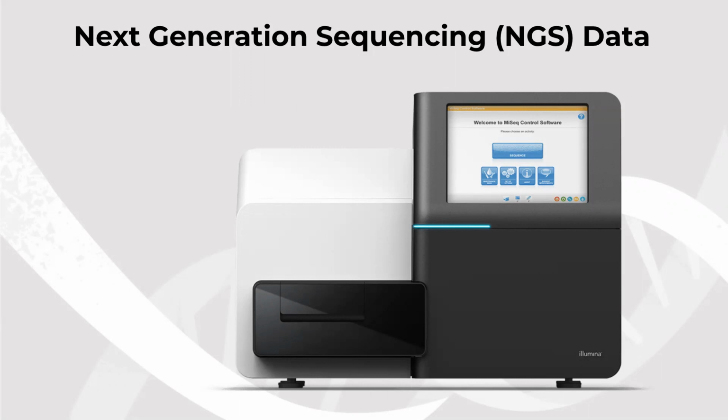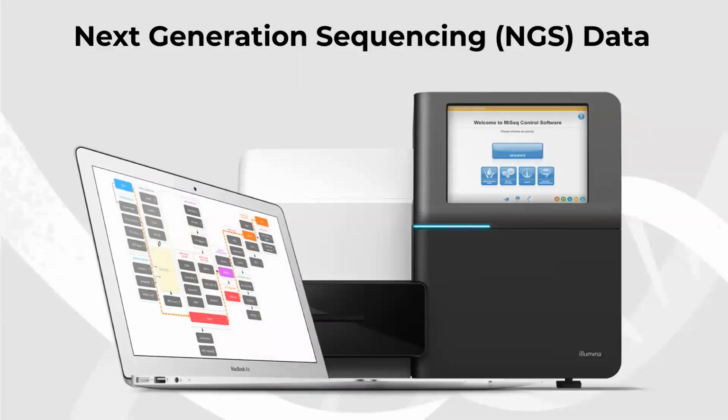Whole transcriptome sequencing provides a comprehensive view of cellular transcriptional profiles at any given biological moment. And what it does is it greatly enhances the power of RNA discovery methods. In order to study this data, we have to run processing pipelines that turn raw reads into structured data that's ready for analysis.